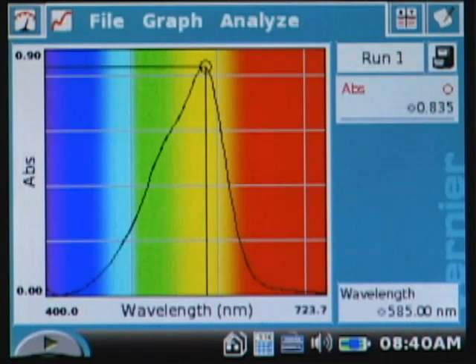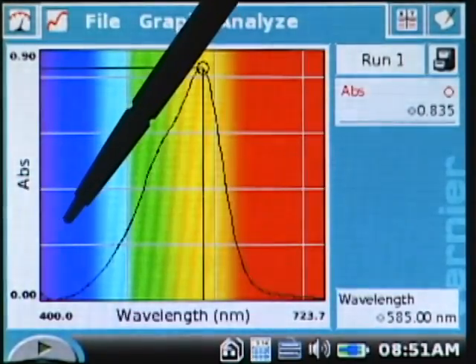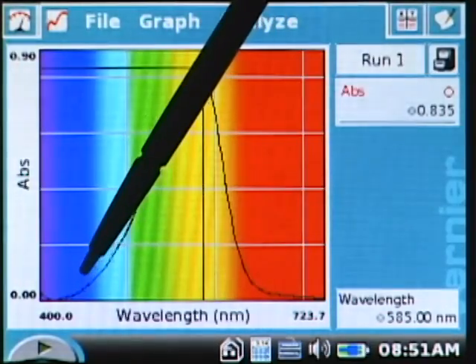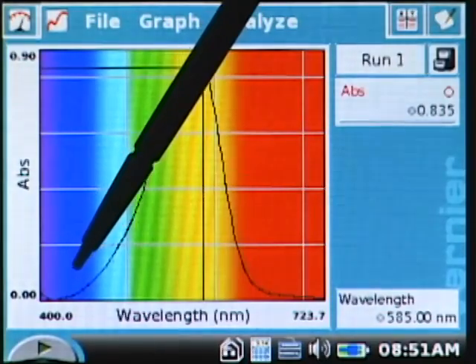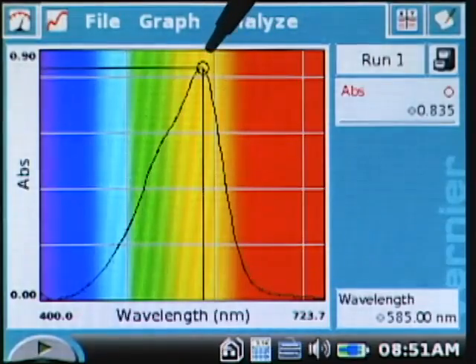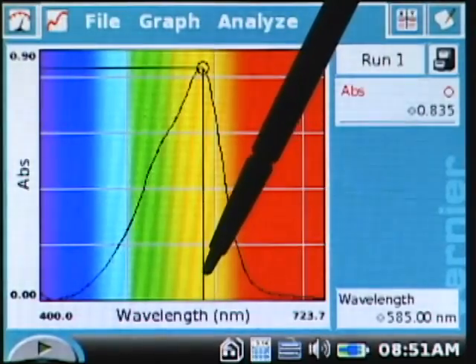This is also a teachable moment: if the student looks down at the violet region of the spectrum towards 400 nanometers, they can see that the absorbance is very close to zero — this would not be a good wavelength to use because the violet solution is transmitting most of the violet light. They can then see that the absorbance they want to use is somewhere else in the spectrum, in this case towards the yellow end around 585 nanometers.